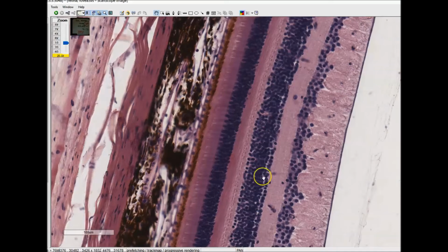So what's in these things? Well, I said this is ganglion and this is axons. Here is the interface between all of these cell types and the ganglion cells. So it's where they are synapsing and exchanging information and so on. There are 4 different cell types in this inner nuclear layer, and those are amacrine cells, bipolar cells, horizontal cells, and Mueller cells.